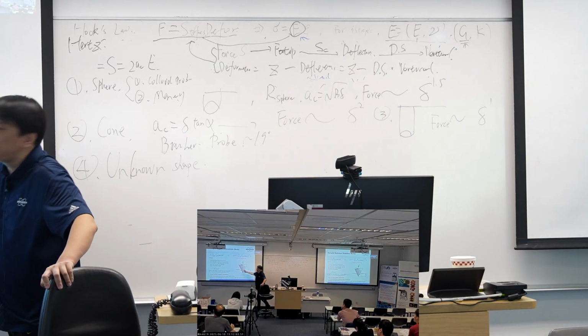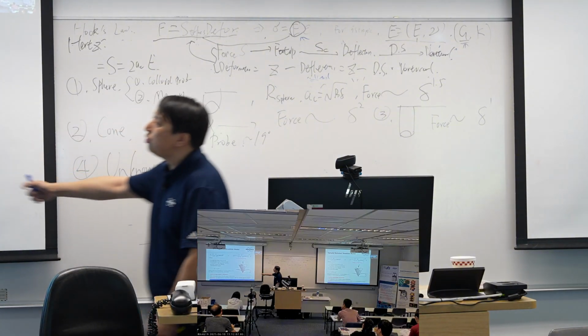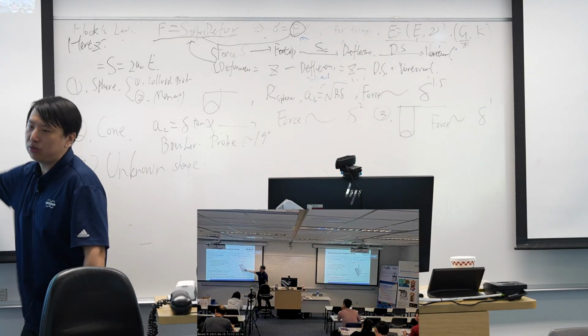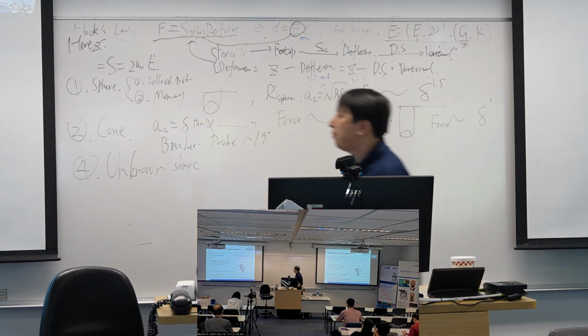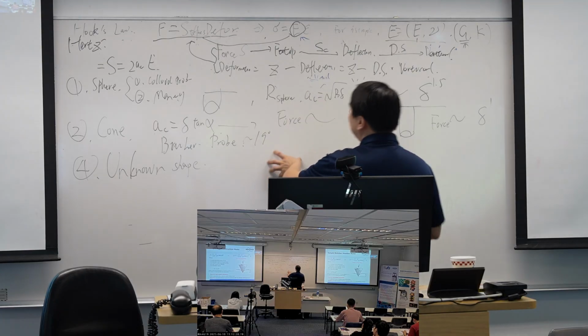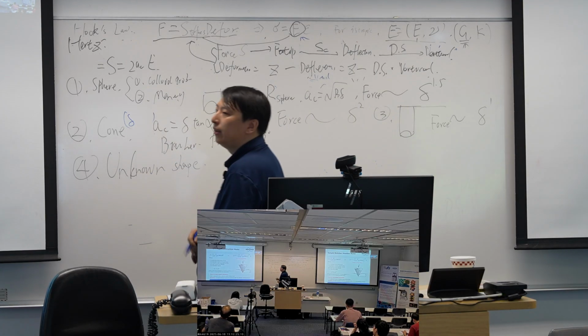So I cannot use the Sneddon model directly. The Sneddon model, from its description, requires the probe to penetrate the sample, so the deformation should be very large. For this model, they require delta to be large.